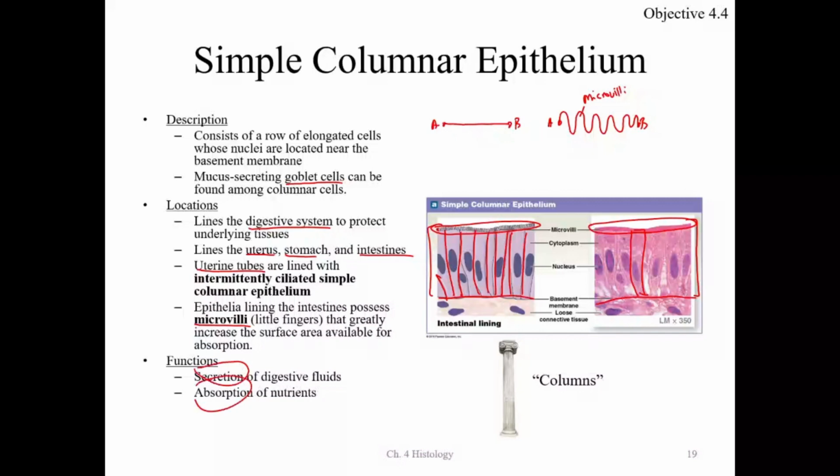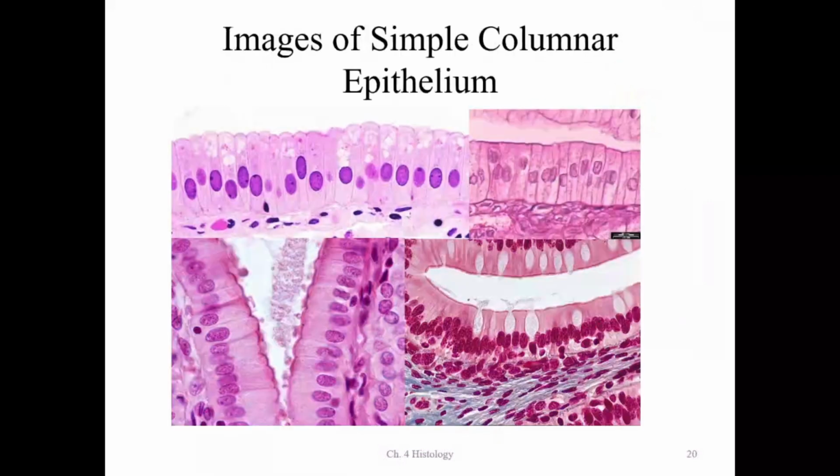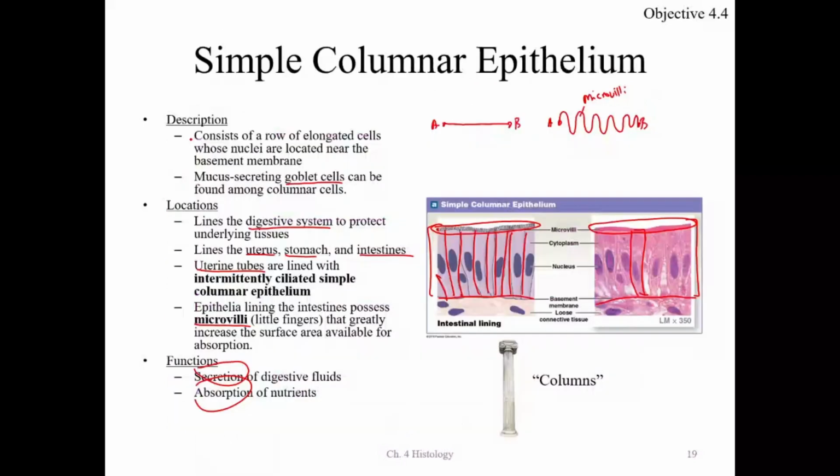Basically, all epithelia, what they do is they protect, they secrete, they absorb. That's their main jobs. Protect, secrete, and absorb. Alright. So let's look at these. Some people say they look like popsicle sticks. Little popsicle sticks or little bits of gum. Here's the bottom. Here's the top.